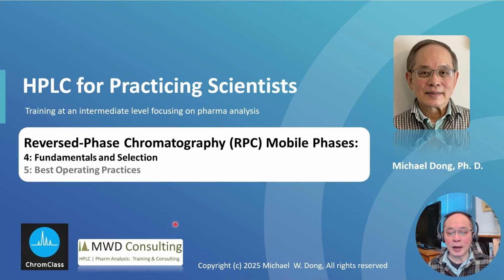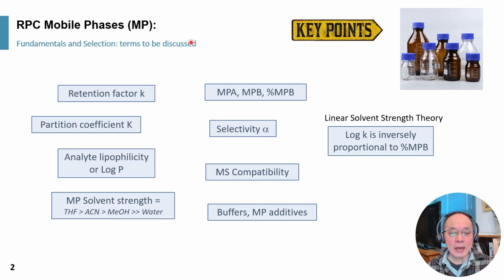Hello, everyone. This is Michael Dong, and here we're going to talk about episode number 4, reverse phase mobile phases, the fundamentals, and also selection. Here are some of the key points summarized in the slide. We can talk about all these topics to some degree.